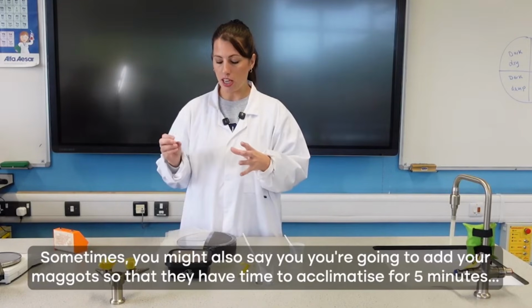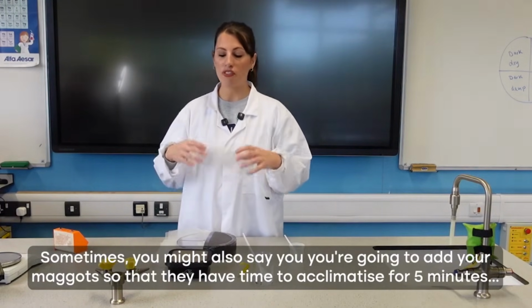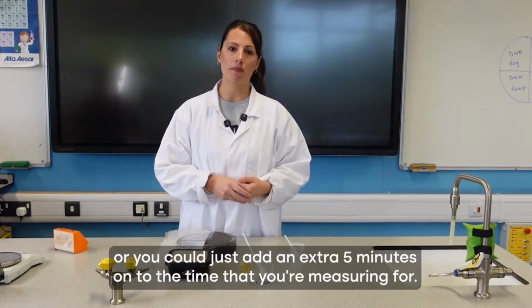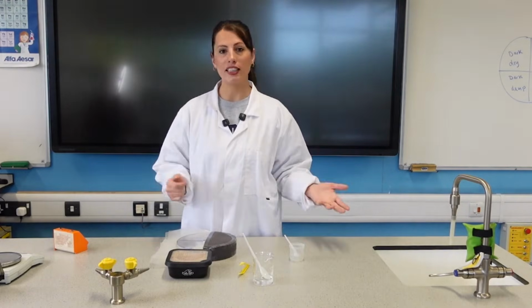Sometimes you might also want to say you're going to add your maggots so that they have time to acclimatise for 5 minutes before you record the results, or you could just add an extra 5 minutes onto the time that you're measuring for. So you could say 10 minutes, I'm going to leave them for instead of 5, and that will take that into account as well.